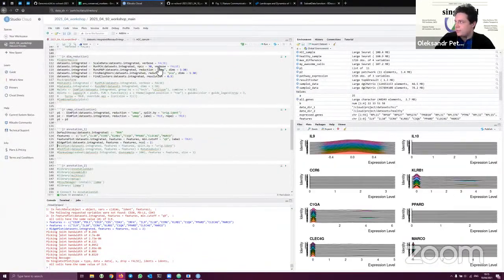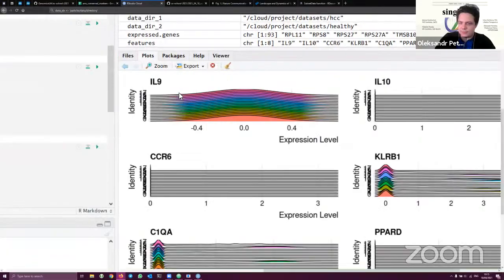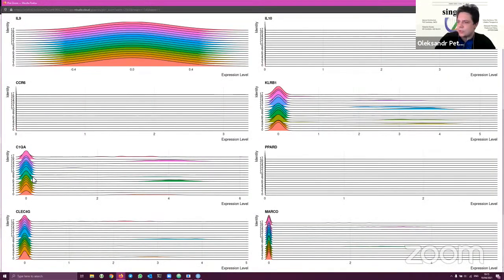I also would like to add that there is another way to do these observations. You can start by plotting these genes, but what I usually do is check this table where the marker genes for particular clusters are already presented, and that's step number 2. We'll go for it. Yeah. Okay. Yeah. Good. No spoilers.